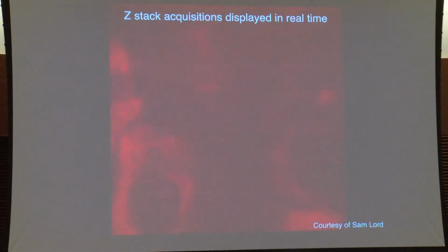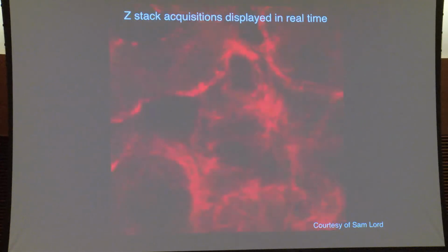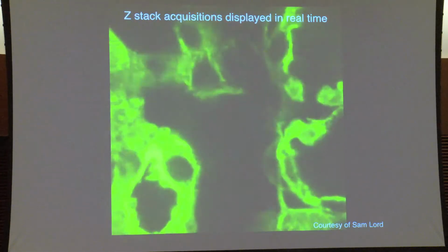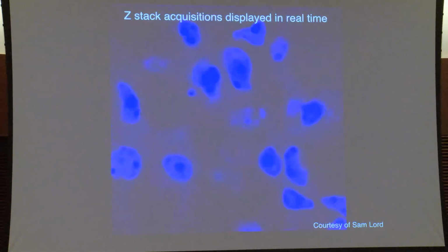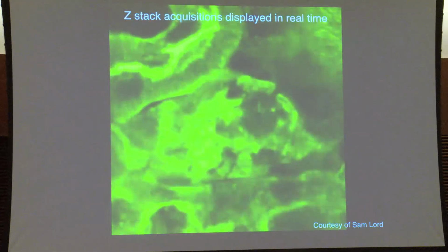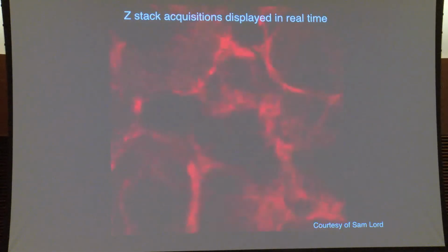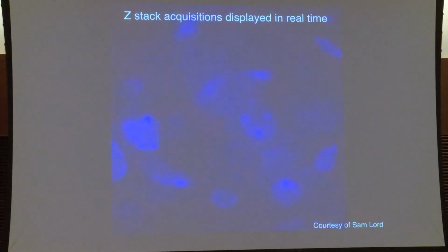And the nice thing about the way µManager does this is that once you've configured the microscope correctly, all the user needs to do is turn on or turn off the hardware-triggered sequencing, and the multidimensional acquisition interface will automatically decide which of the parts of the acquisition can be hardware sequenced, and it automatically loads those sequences onto the hardware and runs it. So it's very easy for users to figure out how to run fast acquisitions.